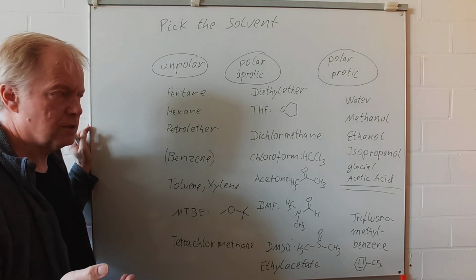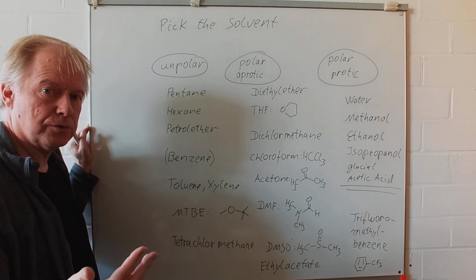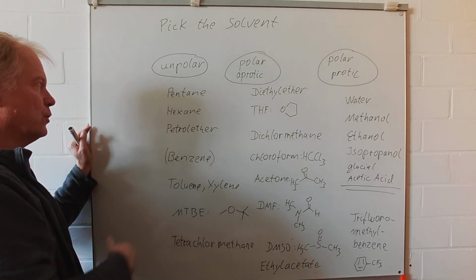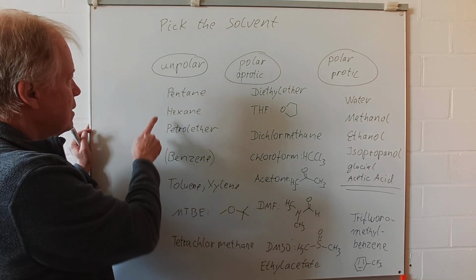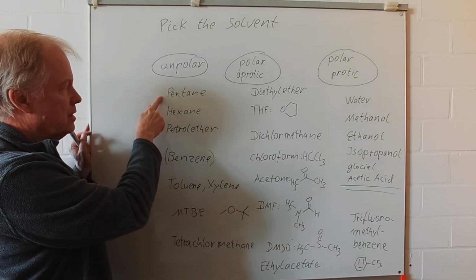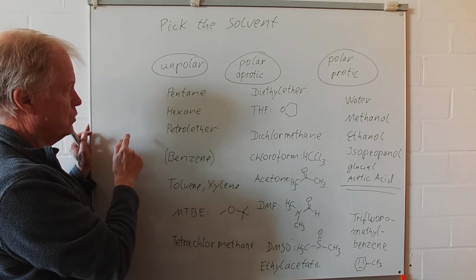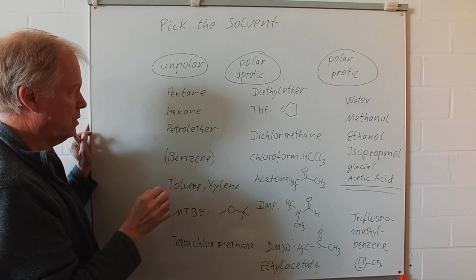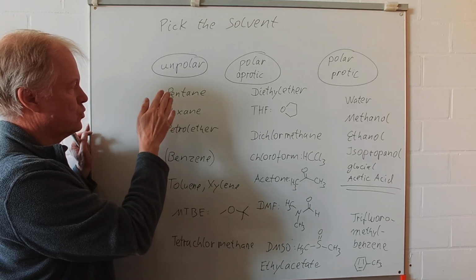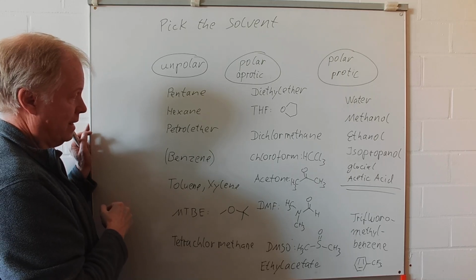Those are solvents that are, of course, polar and have acidic protons, usually at OH groups. So let's go through that list. In the group of the alkanes, pentane is the least polar molecule. Hexane is a bit polar. It has the disadvantage that it is the most toxic one among those small alkanes.